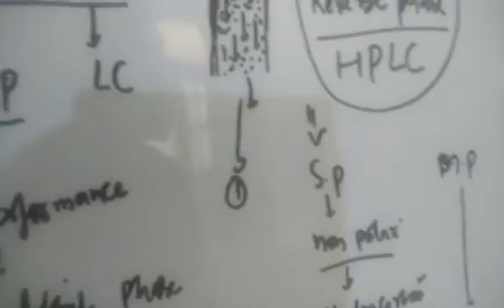Now, moving on to the basic setup of this HPLC. So this was in general the basic description of chromatography. So what are the components or the instrumentation? If you look at the components of the instrumentation, we'll start with the components of instrumentation for HPLC.